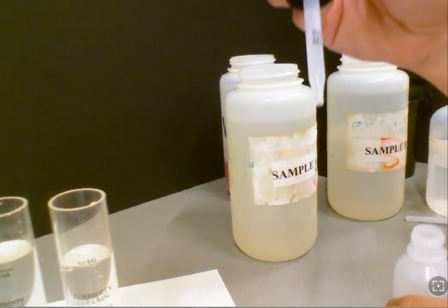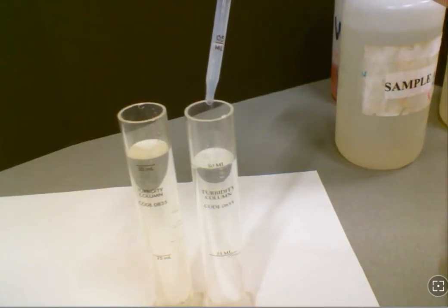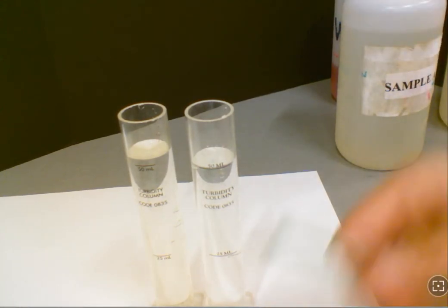your distilled water sample. Did you hear that? The distilled water sample, not the stream sample. And as you do that, that's going to make that sample a little cloudier, if you will, so that we can make that comparison with the actual stream water.